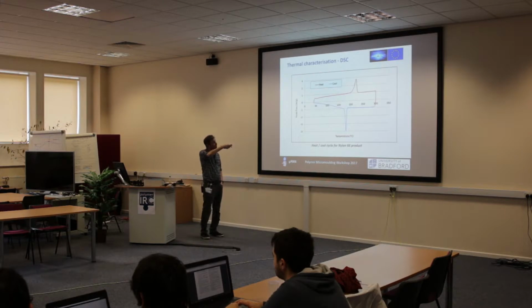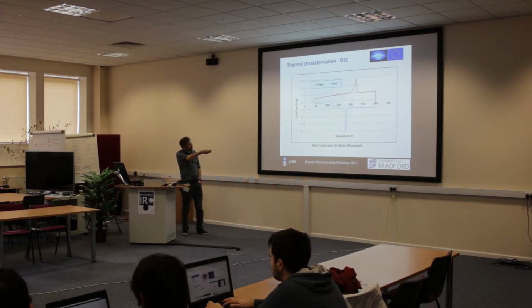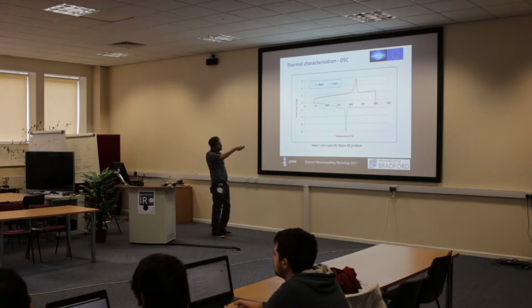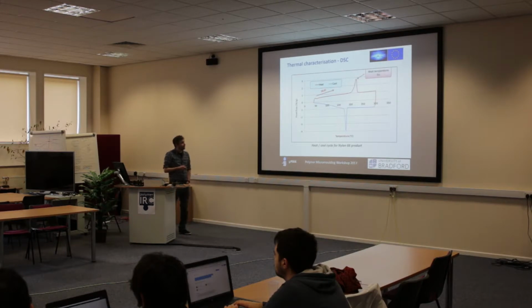So all we've done is gone through the melt. Here we're fully molten. We've got a molten polymer. And then we drop it back round with the temperature, and you're in charge of setting your temperatures. You don't want to go anywhere near your degradation temperature or you're just going to mess up your results anyway. And then on the way back down, this is at a 10 degrees C per minute cooling rate, we're getting a recrystallization peak at about 190, 188 degrees C. Looks quite easy, looks quite nice. For nylon, it's okay. So heat, melt temperature, cool, crystallization temperature.